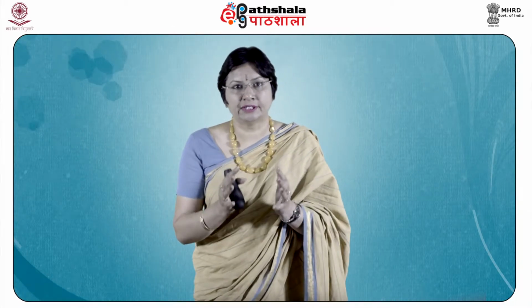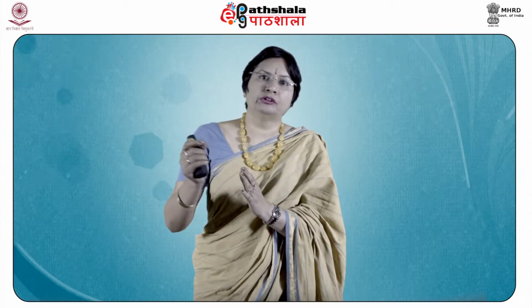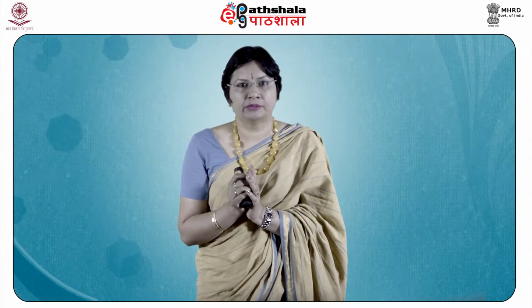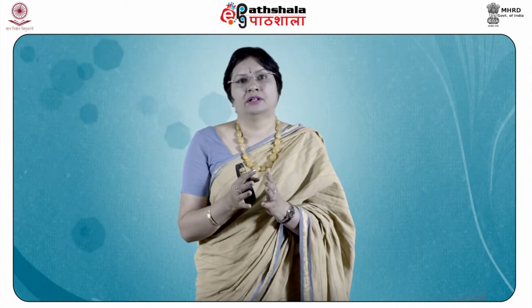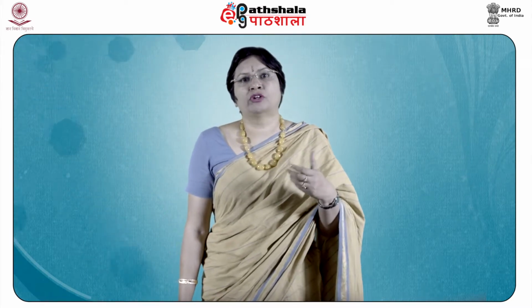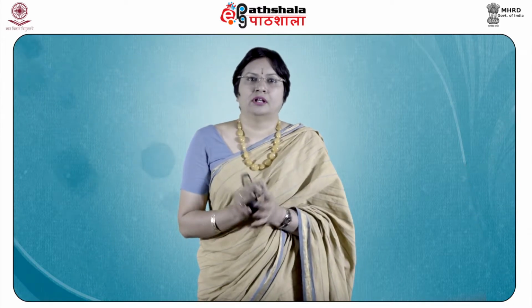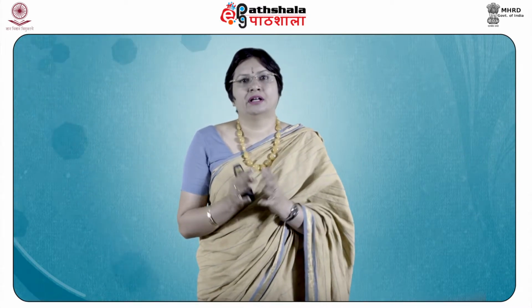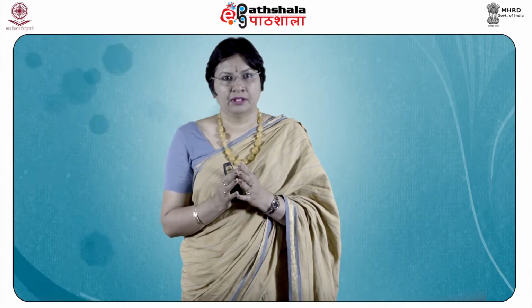So, when you are in a forensic lab, you take a known cation and carry out that test, and you also conduct a similar test on the sample you have collected from the scene and compare them. That will guide you whether the test is positive or not. Let us see what the various tests are that you have to perform in the forensic lab. So, dear students, with this background, let us try to understand how you can perform the various tests in a forensic lab.